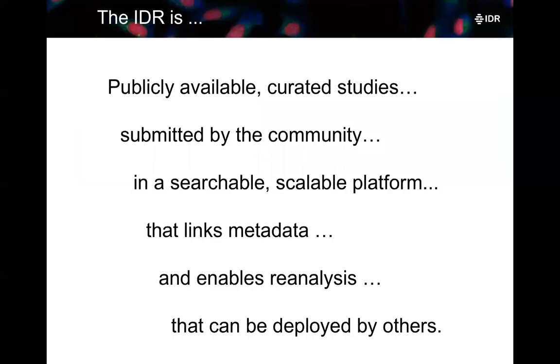Now, to quickly summarize, the IDR is publicly available, curated studies submitted by the community in a searchable, scalable platform that links metadata and enables reanalysis that can be deployed by others.